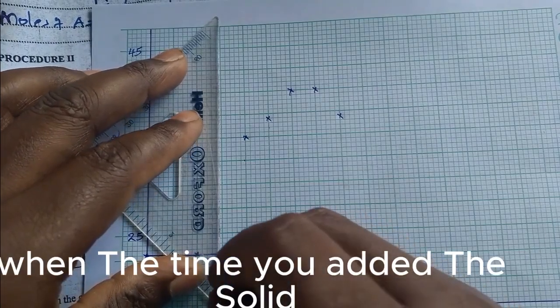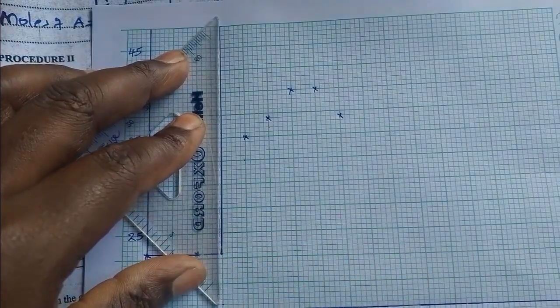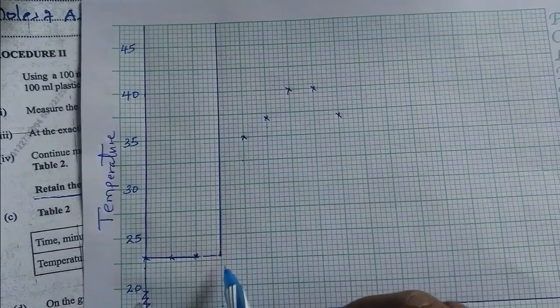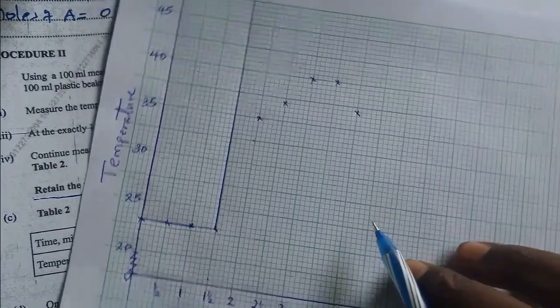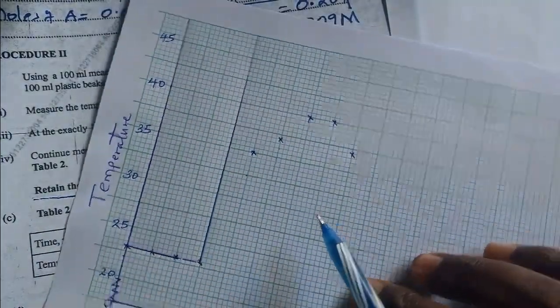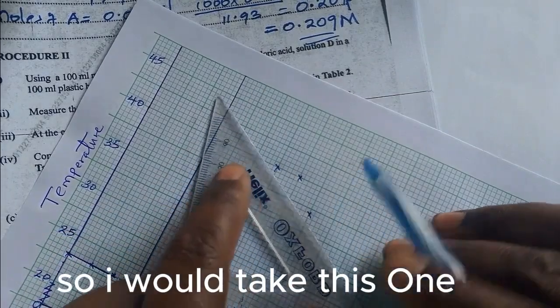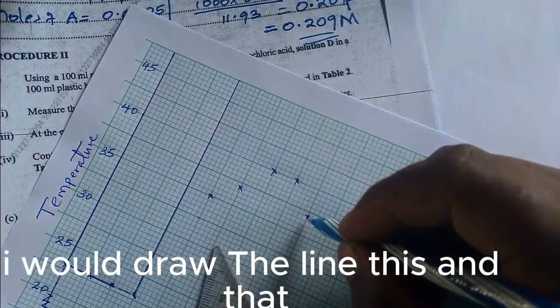This is the time you added the solid. So we need to draw a line towards our reference point to get the maximum temperature. So you need to check whether to draw this one or this. I will take this one. I will draw the line this and that.